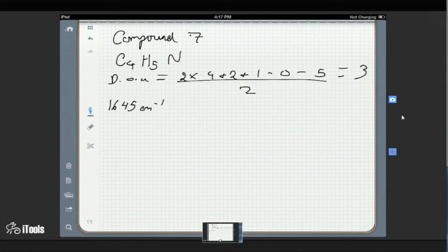So these are all of our C's. Actually, no, we don't know if these are C's. I mean, they would have to be C's, right? Could this be an H? Yeah, perhaps, maybe. All right, let's just keep going. Any of them could be. Plus, we don't have any methyl groups. We don't have any singlets either. So, with doublets, let's look at the doublets.